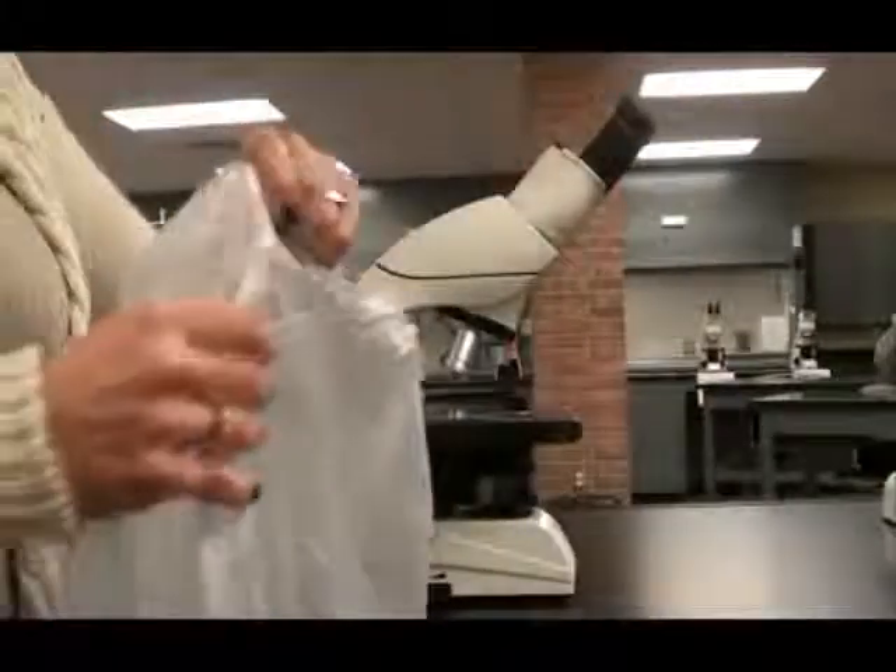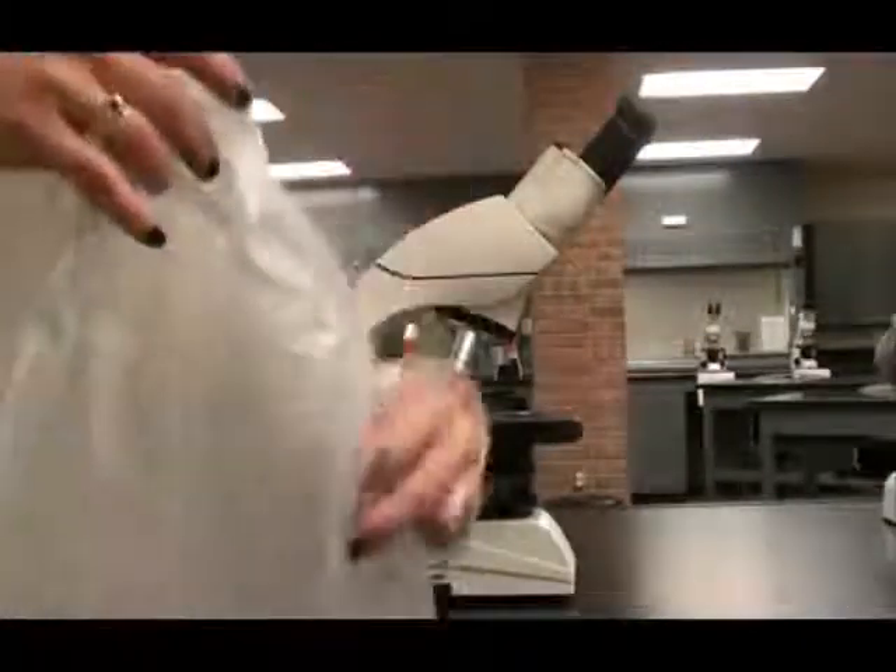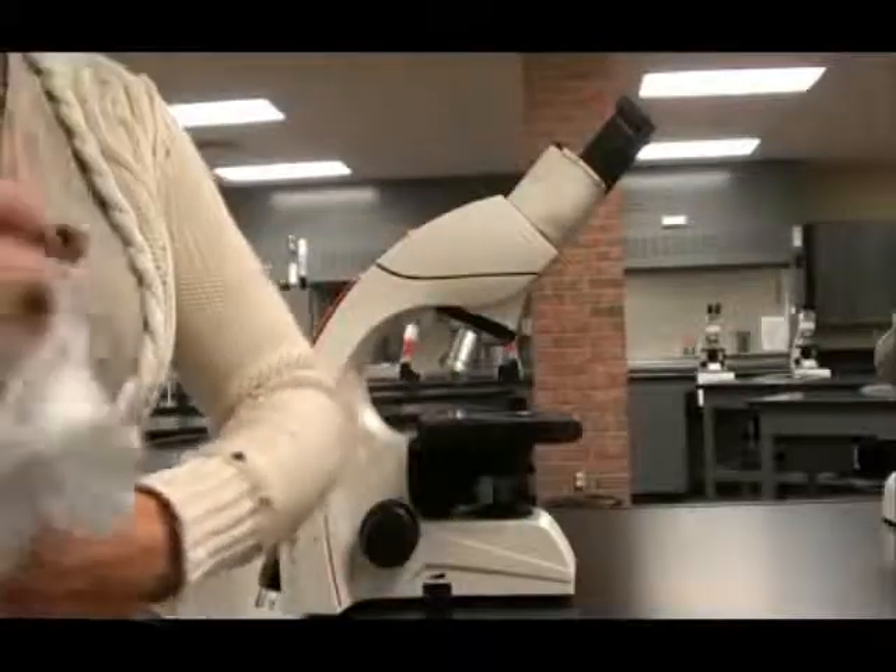Once you transport your scope back to your station, remove the dust cover, fold it up, and place it in an out-of-the-way location to keep your workspace uncluttered.